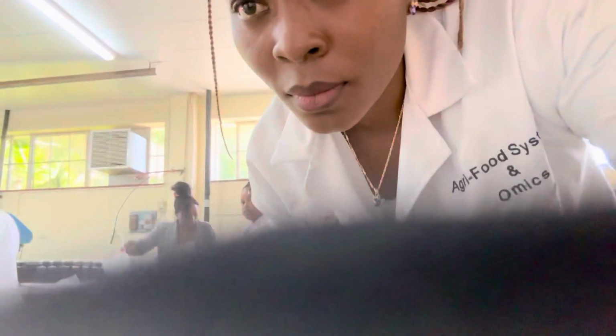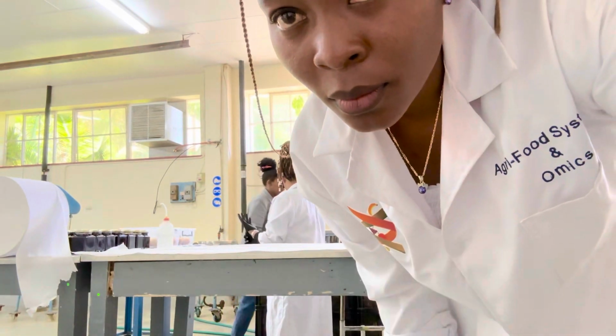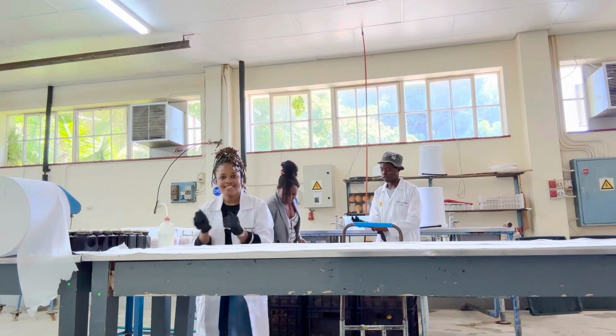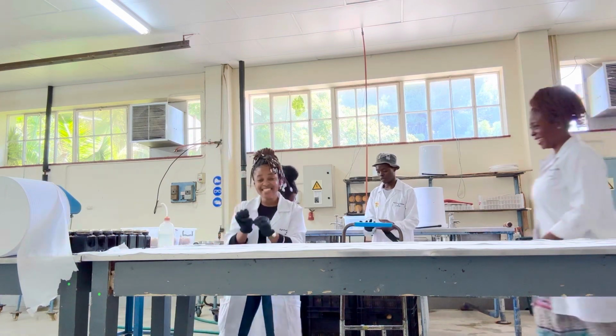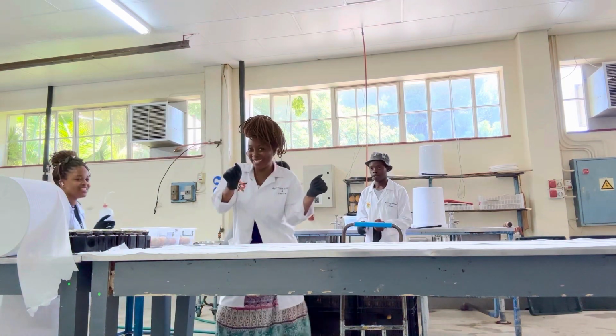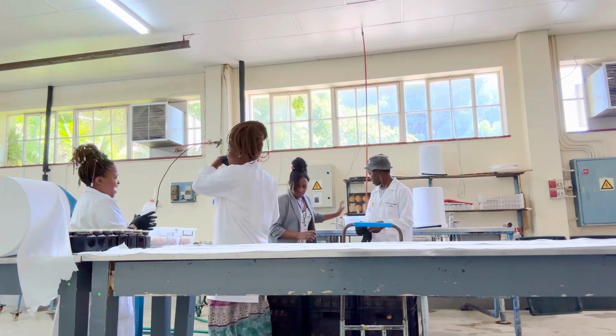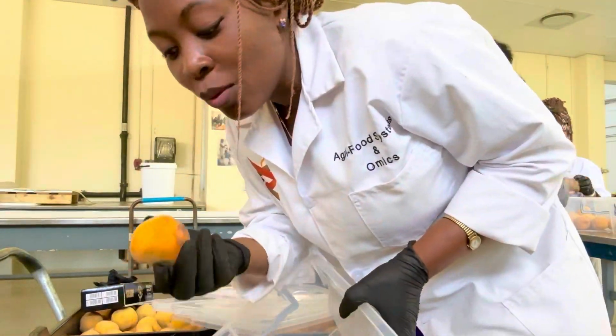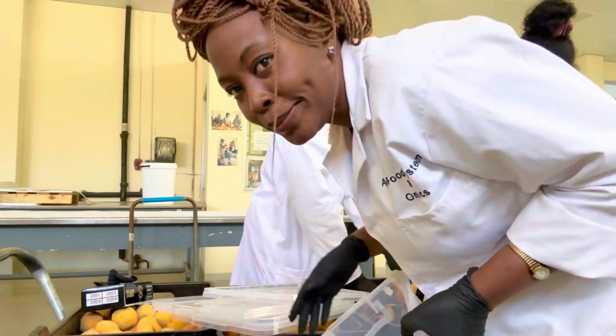So guys, you know what we're gonna do? We're gonna sanitize the fruit. We are sorting out the fruit now, the bad ones. See, this is bad. We put the bad here and then the other ones we sanitize. See them dimple.